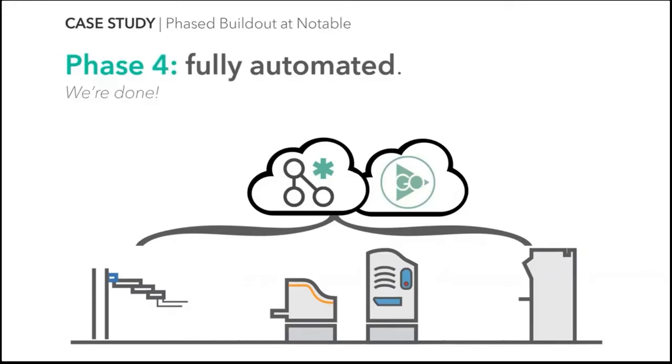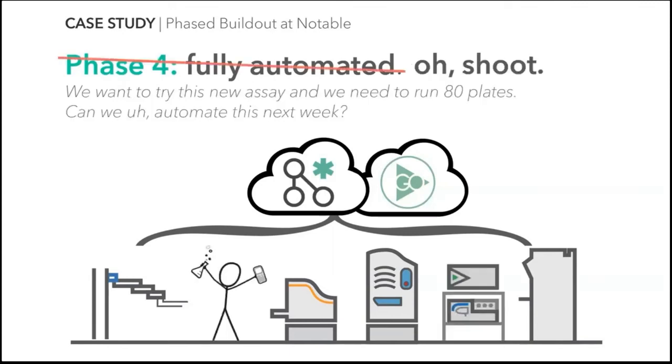And finally, as time goes by, we reach full automation. In this phase, you're more sure of the steps in your process and the instruments that you need. Here, a scientist is just needed to start a run, and the work cell automates the assay end to end so they can walk away for the end of the process. So we reached this phase, great, we built it, we're done, right? Of course not. So this is a true story.